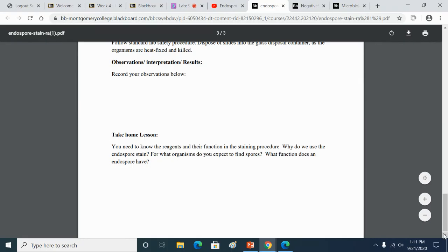And it's especially true for a young culture. If you have a culture that's 24 to 36 hours old, you're probably not going to find any spores. But where they do start is at the very top. So something to think about if you were in lab, which you're not going to be, but if you had a culture and it's really young, you really need to go to the top to find spores. But if you have a really old culture, not only will you find spores everywhere on the slant, but near the top, it will be nothing but spores. All the vegetative cells are dead.